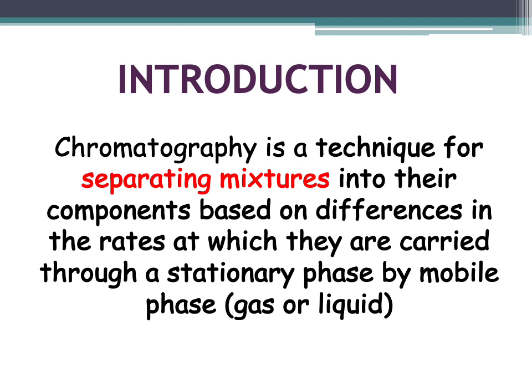So as an introduction, chromatography is a technique for separating mixtures into their components based on differences in the rates at which they are carried through a stationary phase by mobile phase, gas or liquid. So from here you can see that chromatography is a technique for separation. Teknik untuk kita separatekan mixture. So for example kita ada mixture. Mixture ni kita tahu kan dia adalah combination daripada a few substance, a few molecule. So kita nak separatekan dia daripada molekul-molekul tu. So ni chromatography adalah teknik untuk separating the mixture.